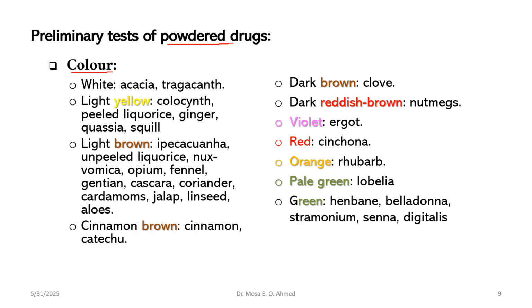We can go through these different types of powdered drugs. We know their color. We know that they are in powder form.